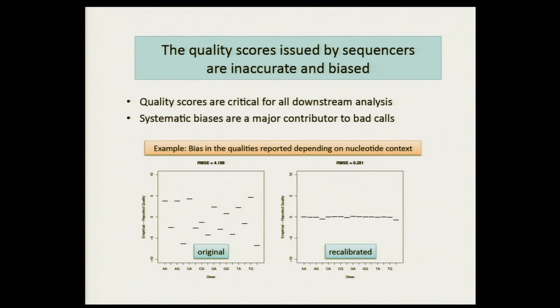Any other questions? Does this make sense where we're going? Okay, so I'm going to give a little bit about the mathematics and how this works. It's actually very simple. And then I'm going to show you lots of data and try to explain how many sequencing vendors do not do a very good job of estimating these quality scores. And then we'll show you command lines and things.